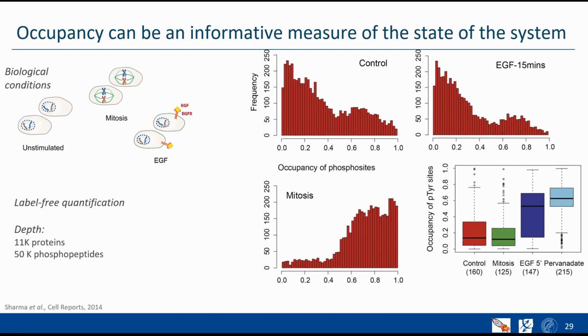This is good, of course, but it was also challenging because you need a lot of peptides, a big coverage. It's not like with proteins where you have one or two peptides and then the protein is somehow quantified. This is really on the peptide level. So it needs a lot of measurement data, and this was a very deep proteome.